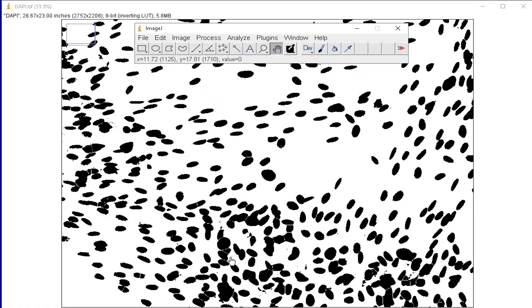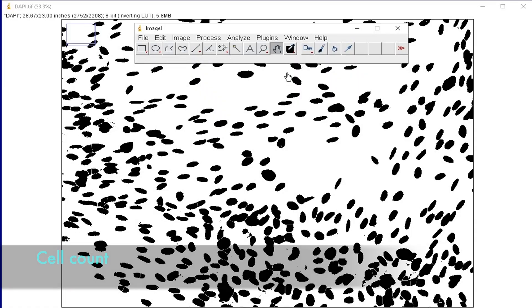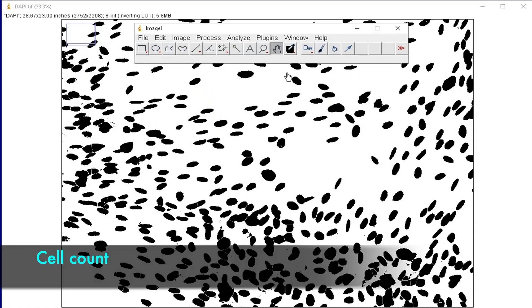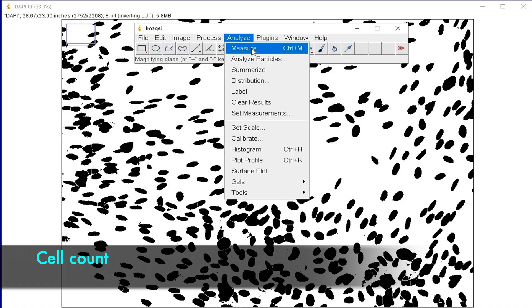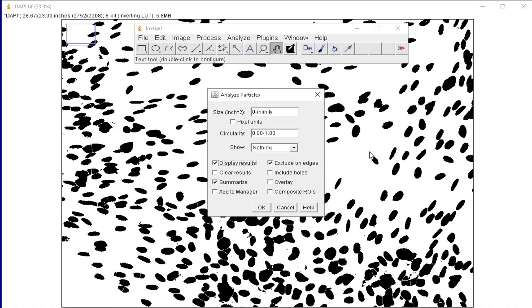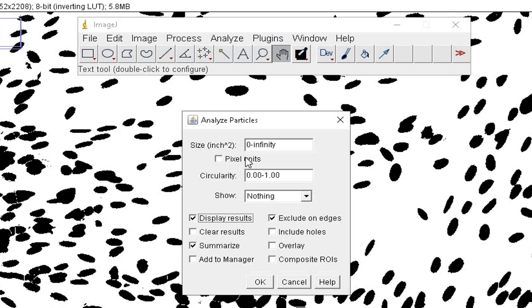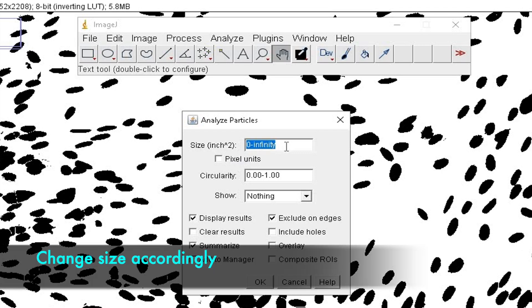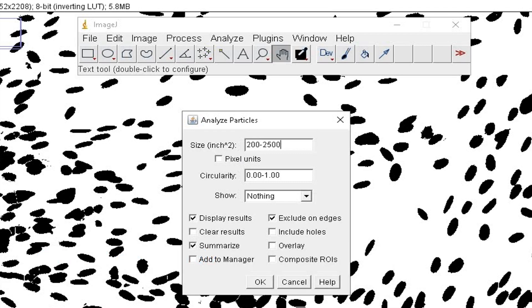Now, let us count the number of cells. Click on Analyze, and Analyze Particles. In this dialog box, change the size from 200 to 25,000.